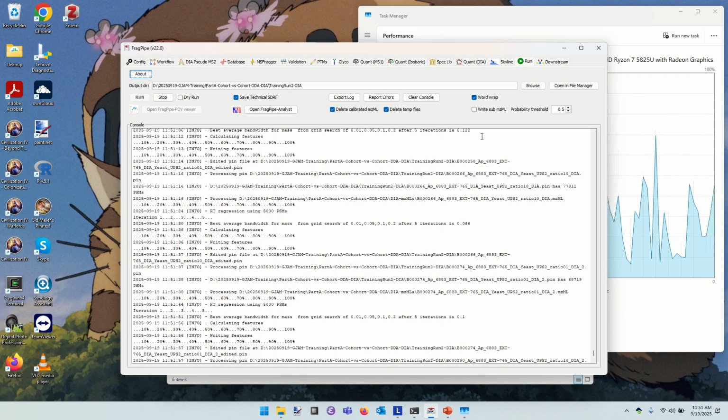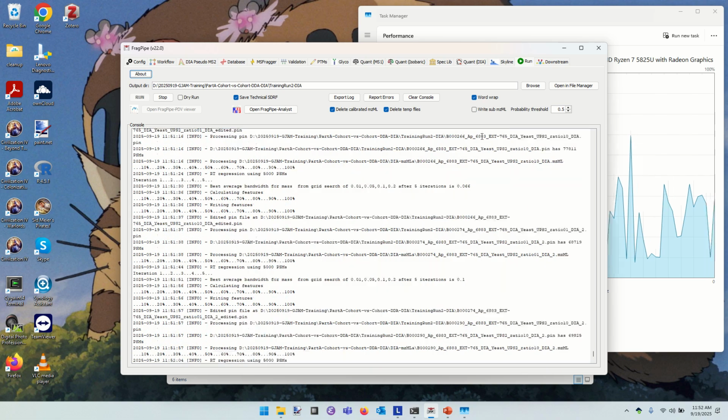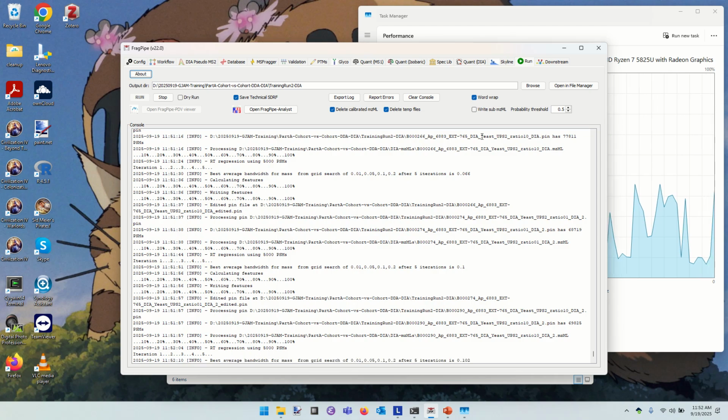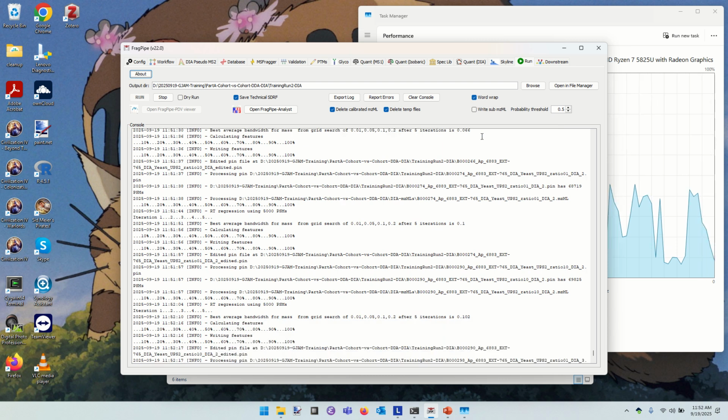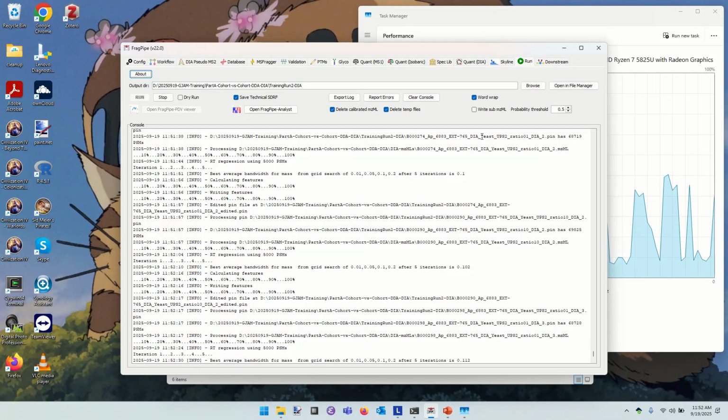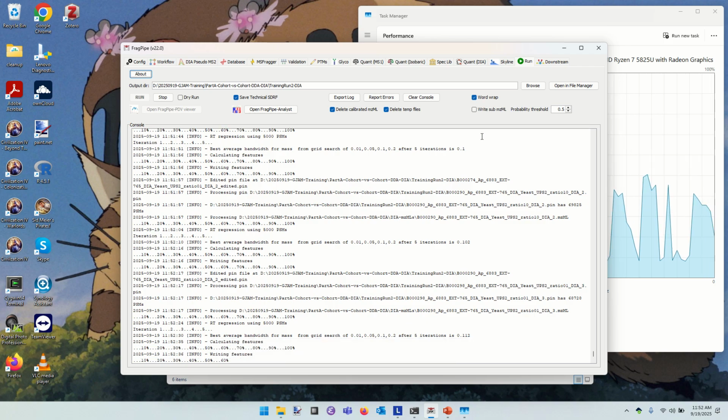Is it possible that the pump is a little irregular, and so the gradient is a little higher in overall hydrophobicity in one experiment than in another? Yeah, that can happen. So we want the ability to say that a peptide seen at this retention time in this experiment is the same peptide as was seen at this similar but different retention time in another experiment. That's what retention time regression is all about. I did mention this stage would take a little longer than the DDA experiment.